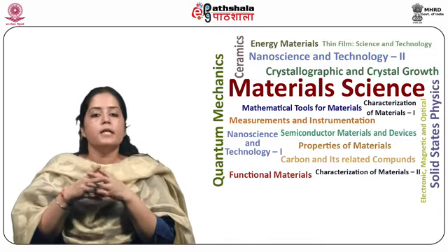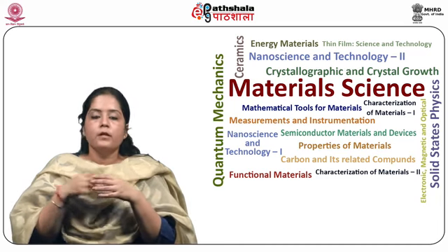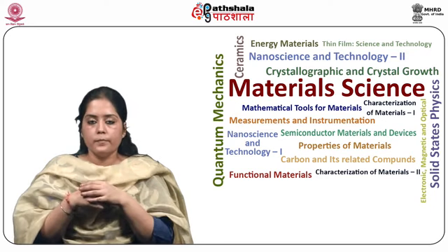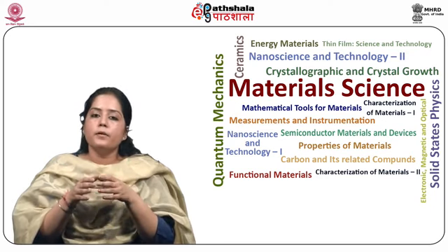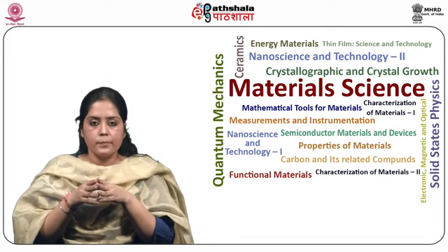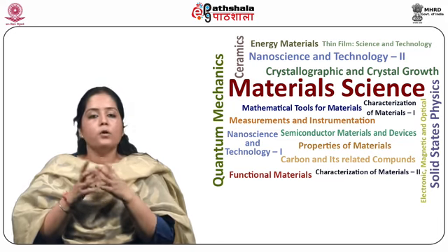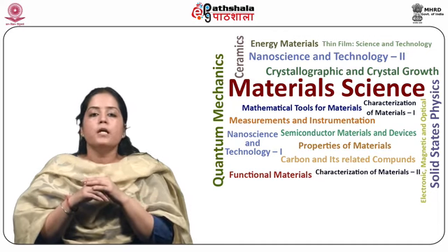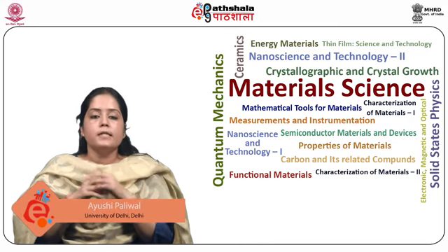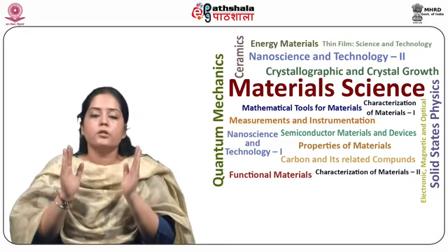So students, let us summarize what we have learnt in this module. Firstly, we discussed the UV visible spectrometer. Secondly, the principle of UV visible spectrophotometer was discussed. Thirdly, how to measure the optical band gap was discussed in detail. Lastly, the UV visible spectrophotometer instrument details were discussed with a detailed description of each component.